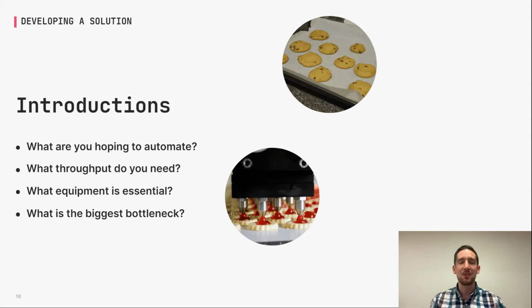So the analogy I like to use here is, if you said, I need to bake 50 cookies a week, you're probably going to build something that looks more like a kitchen in your home, because that's going to be plenty. But if you say I need to bake 5,000 cookies a week, you're probably going to have some sort of industrial automation platform that has dispensers and a huge oven to reach that throughput. Those two solutions would have different timelines. They would have different costs. They would have different complexity, and one would probably be overkill. So we can definitely do solutions at one end of that spectrum or the other. It's just making sure that it's appropriate for the project.